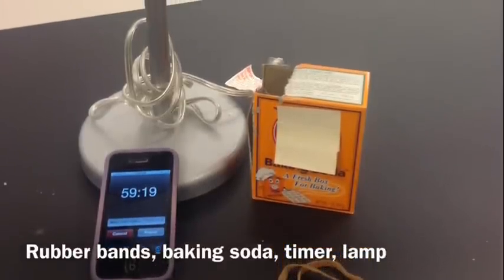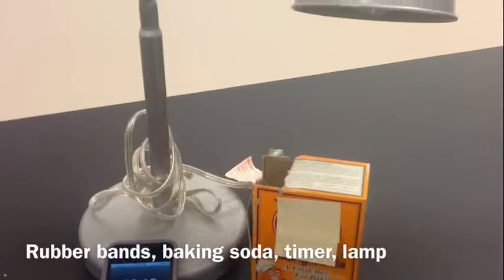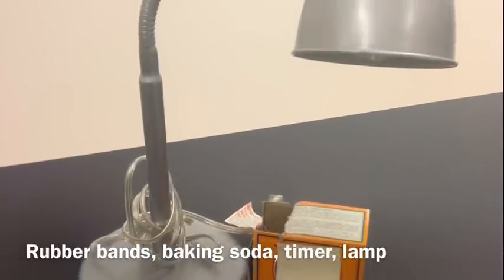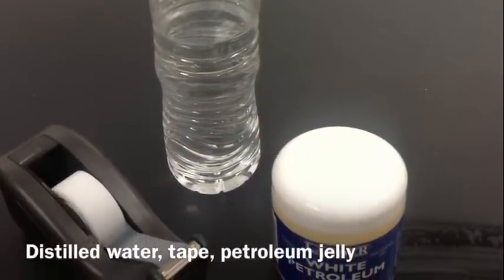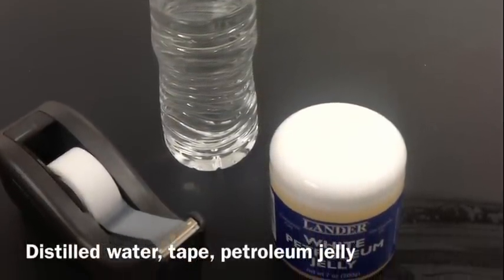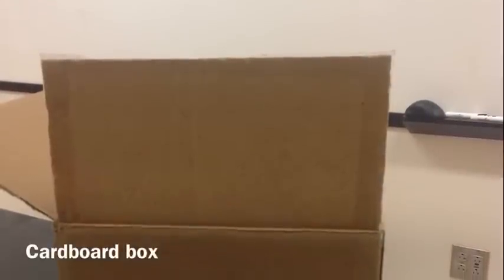You'll need two rubber bands, something to use as a timer, some baking soda, and a lamp that can be fitted with a 100 watt bulb. Also gather clear tape, some distilled water, petroleum jelly or some Crisco, and a cardboard box or some dark fabric to put over your respirometer.